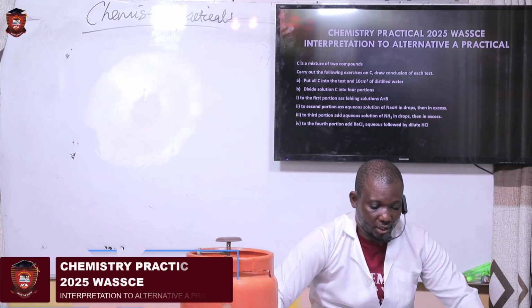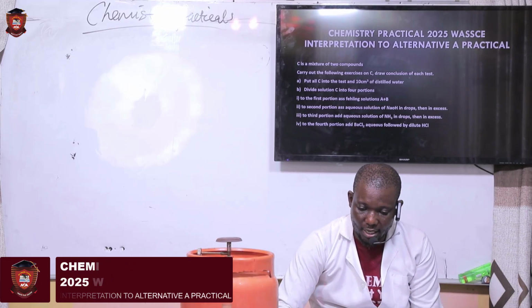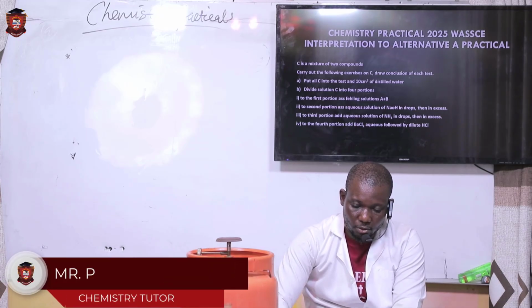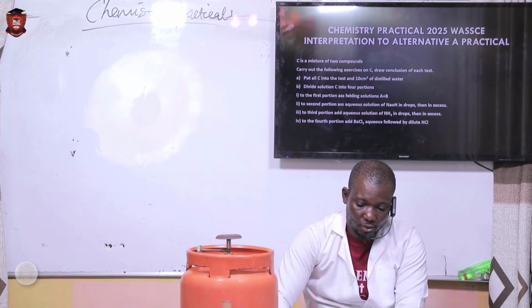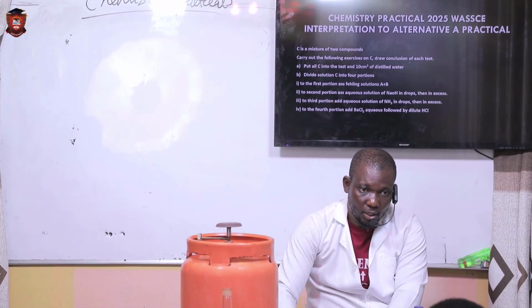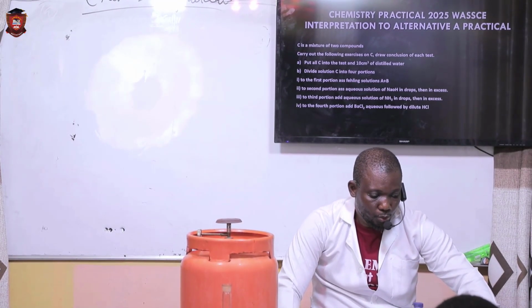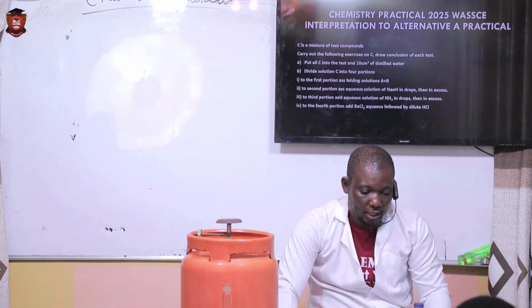Welcome back. In this video lesson, we'll be discussing another important aspect of chemistry, which is the 2025 SSCE WAEC interpretation for question number 2 on salt analysis. We're dealing with two compounds, one organic, one inorganic, and by analysis we are asked to mix the two salts, the two compounds together.